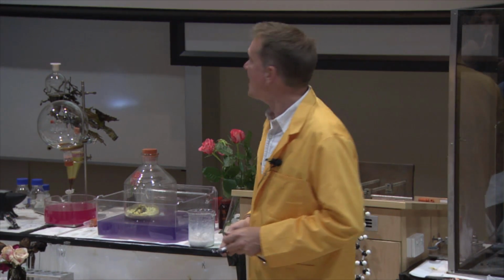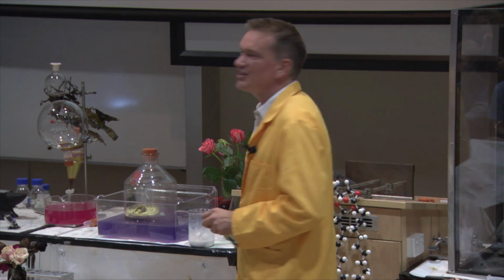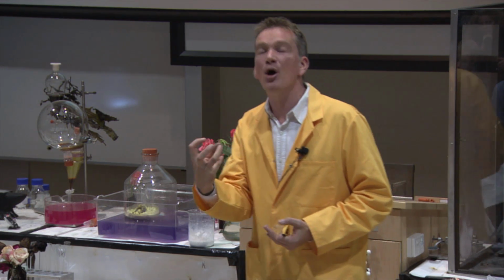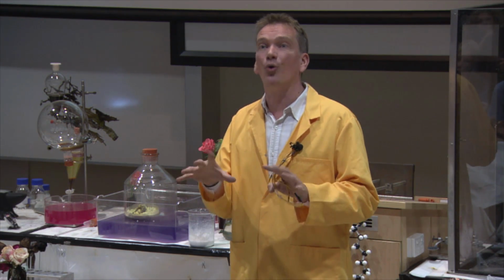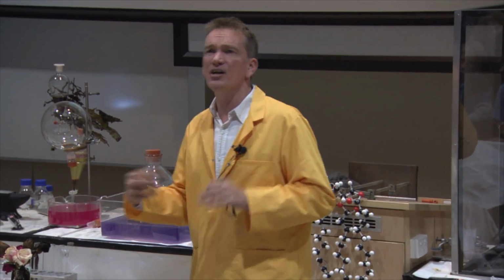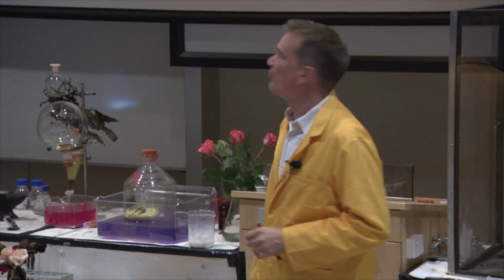So we heat up the hair, and this is how it went, like that. Going to this gooey, disgusting brown mess. And you keep heating it up. And what we're doing here is just breaking down the complex structure of the proteins that are in the hairs, and we're forming, well, things that are just lower in energy, more stable.